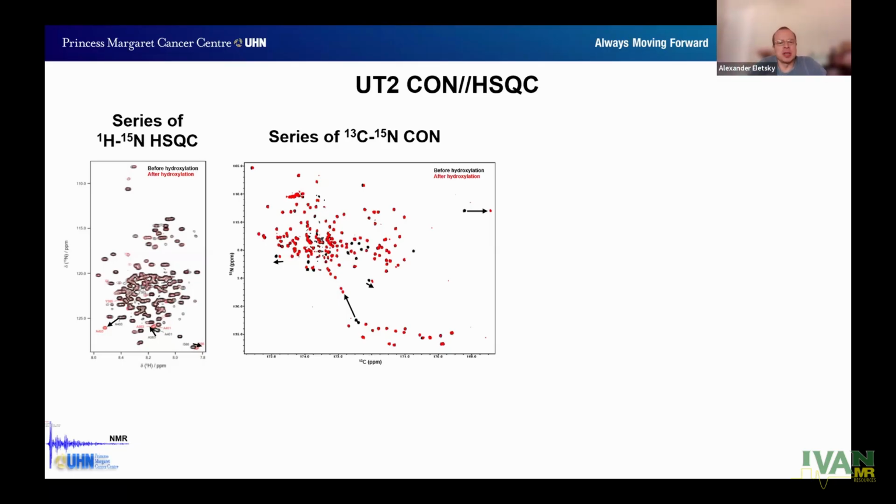Oh yeah, you mentioned the side chain experiment. So is there actually a better way of correlating them? Maybe C delta or C gamma with nitrogen? Because I think the hydroxylation is at the C gamma position, right? Or the carbonyl shift is sufficient.